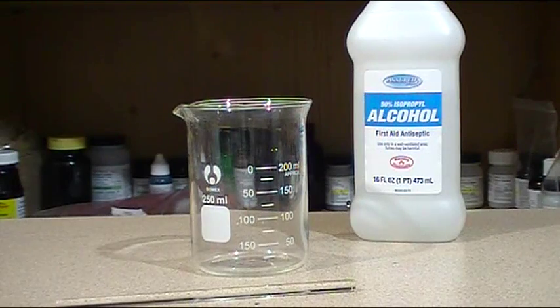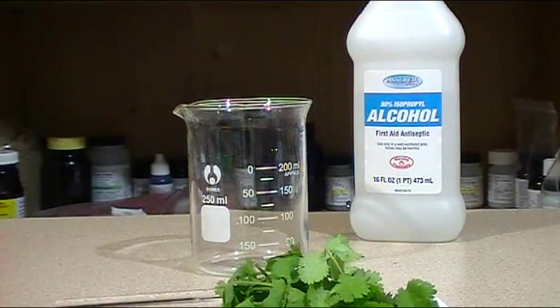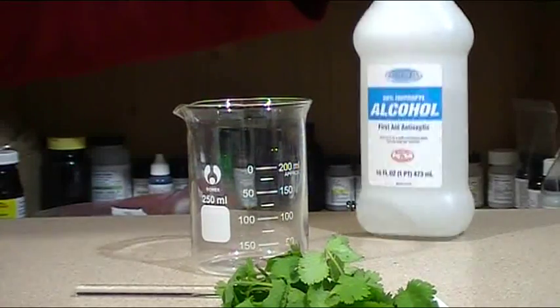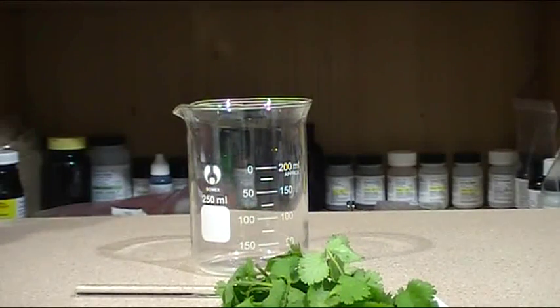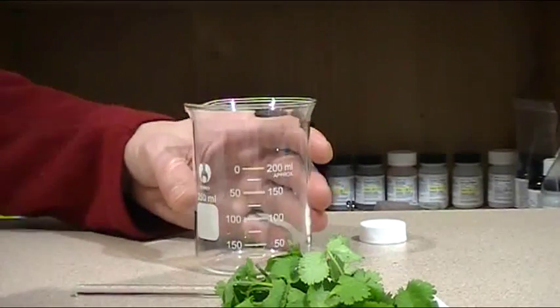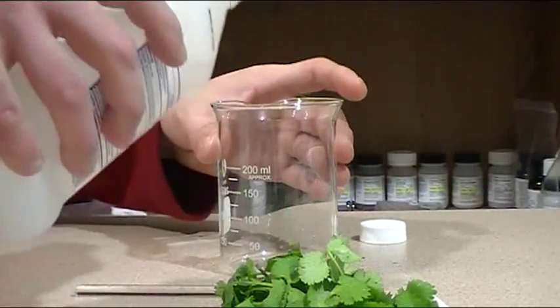This is a quick video on how to extract chlorophyll. I'm using 50% alcohol. You can use water but alcohol works faster.